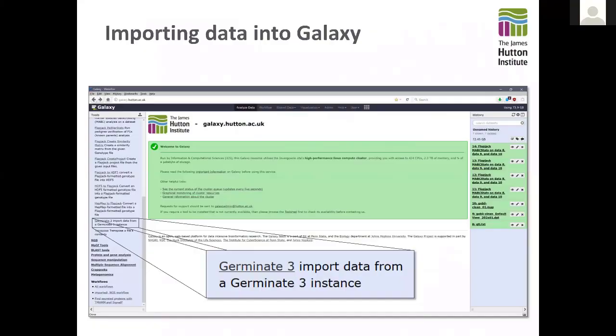So the last integration one I want to talk about briefly is getting data from tools like Germinate and GOBii, and then bringing it back into Galaxy in terms of the nice ways that works. So this is the local Galaxy we have, where as you can see here, we've wrapped up a bunch of the analysis methods from Flapjack itself. But BRAPI is kind of a tricky way to pull data back into Galaxy because of the various API calls that you have to make, and because unfortunately the user interface in Galaxy is not great for the kind of decisions that you'd have to make. You can see even in Flapjack, it wasn't a fantastic UI in terms of the wizard or the steps it went through to pick each section, and it would be even worse doing that kind of thing in Galaxy.